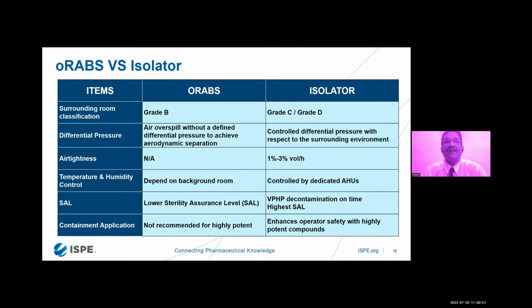So if any liquid gets drained due to a vial breaking inside the machine, and more vials are going to break, this liquid will definitely leak from the base plate into the background area. Whereas in the case of an isolator, it's a completely closed system, so you'll have containment inside the isolated zone.